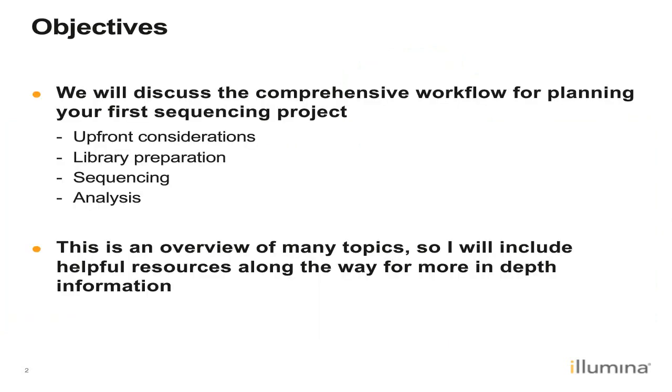Today, we will discuss the comprehensive workflow for planning your first sequencing project, including upfront considerations with an overview of the complete sequencing process, library preparation methods, sequencing, and data analysis. This is an overview of many topics, so I will include helpful resources along the way for more in-depth information.